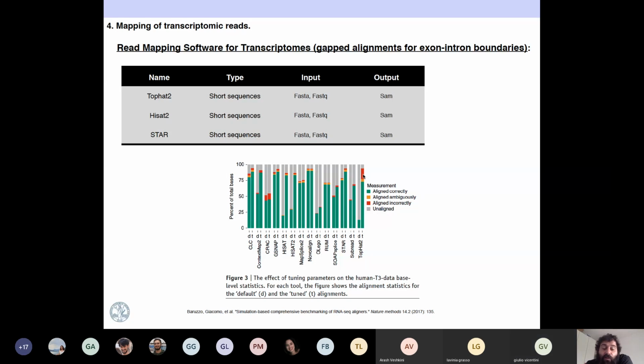Okay, thanks. Yeah, that is doable. Of course, let's put this thing. You have 30% of reads that don't map. You assemble them, and that usually takes 1 day, more or less. And imagine that after you assemble them, you have something like 50,000. Of course, to map 50,000 against NCBI is a lot. So what I usually do is take randomly 20 or 30, and I map those. And if I have a big contamination of something, it's going to tell me, oh yeah, you are mapping human, or 10% or 20% of these that you are mapping are E. coli. That is how you see these things.